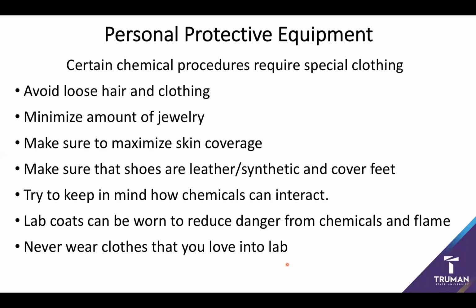And if you don't believe how much damage a chemical lab can do to your clothes, I highly encourage you to come in and take a look at mine or Dr. Lamp's lab coats, and you'll notice, if you're looking for it, all of the nice little chemical burns located on our lab coats. And again, one of the major advantages of lab coats is that they act as a sacrificial layer, so that happens to the lab coat and not you or your clothes.